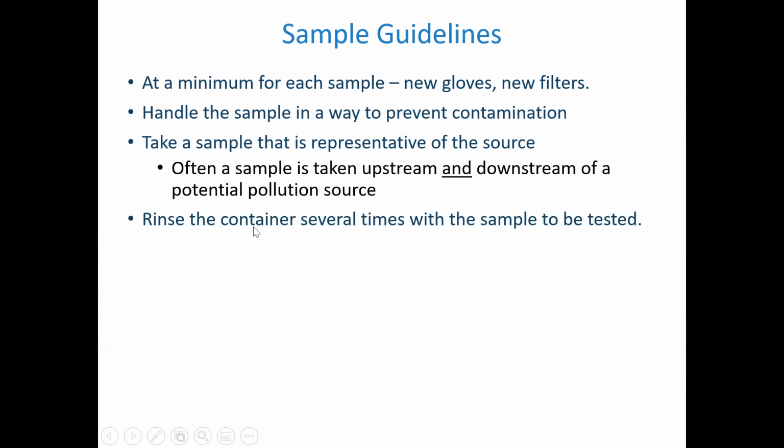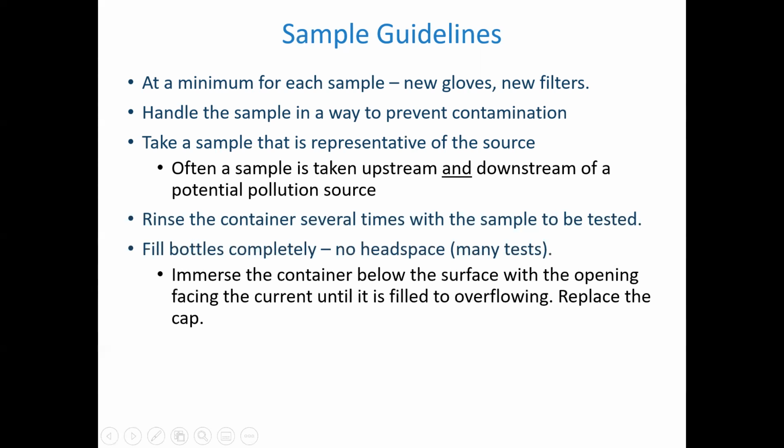Often the container is rinsed, not always the case. Some of those containers, as I mentioned, are pre-charged with a few milliliters of acid and things like that. So in that case, those containers are not often pre-rinsed, but normal plastic containers often are. So you would put the water in, rinse it, maybe, again, I don't know what the standard protocols are, but usually 3 or 4 times is pretty typical, and then fill it up.